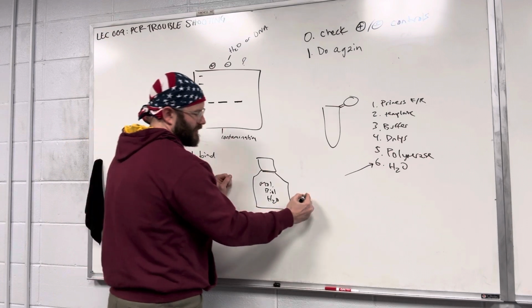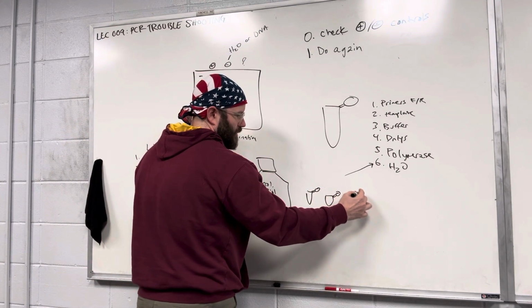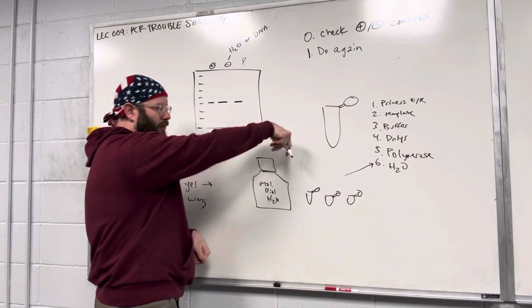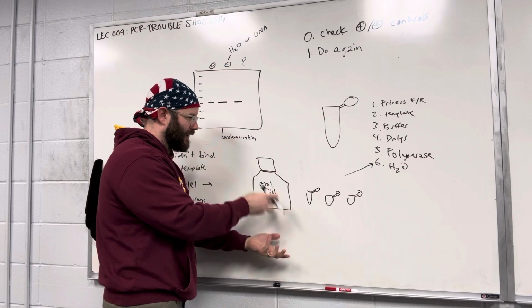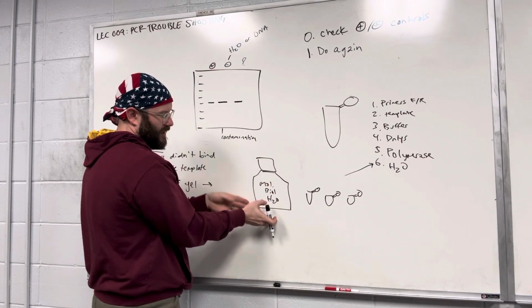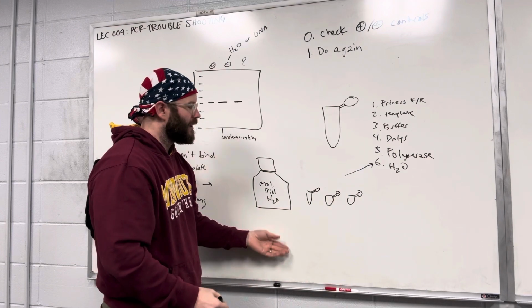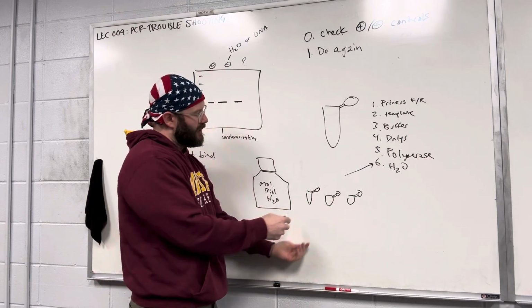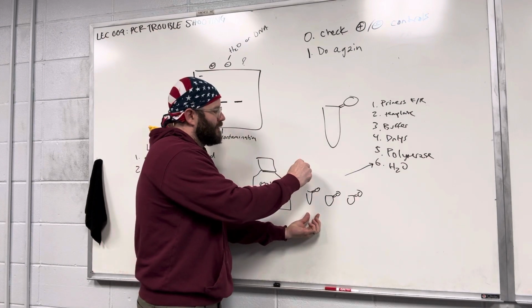You set up tubes at your workstation, open the container, and carefully pour it into the aliquots so you're not getting anything in it. Close it up and put it on the shelf, and keep the aliquots on your bench. When you're running PCRs, you'll be drawing from your aliquots.